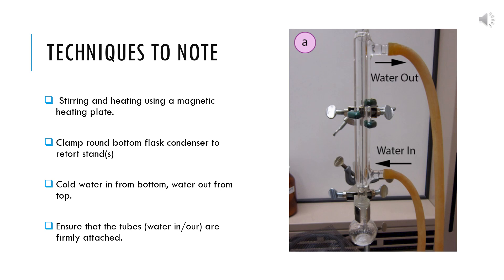Second, ensure that the apparatus are firmly secured by clamping them to a retort stand. The water hoses or tubes must be firmly attached.